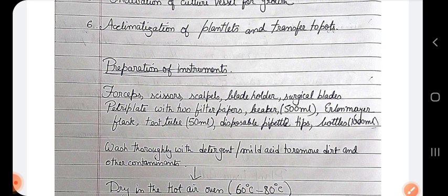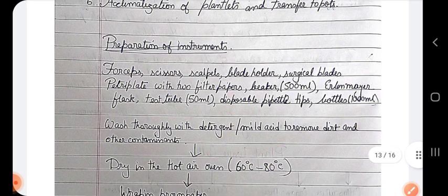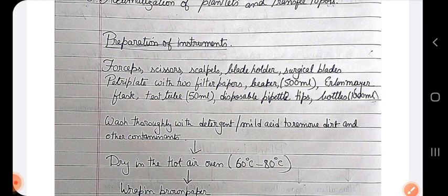Okay, now how is it carried out? All the stuff that is used for tissue culture, like forceps, scissors, scalpels, blade holders, surgical blades, petri plates having two filter papers, Whatman filter paper, beakers of 500 ml capacity, Erlenmeyer flasks, test tubes, disposable pipette tips, and bottles, these things are employed in tissue culture, so these things have to be kept in that place. Okay, and there has to be an aseptic environment, so we have to wash all the stuff with detergent and mild acid to remove the dirt and other contaminants, because previously we have used them for other experiments, so you have to wash them thoroughly.